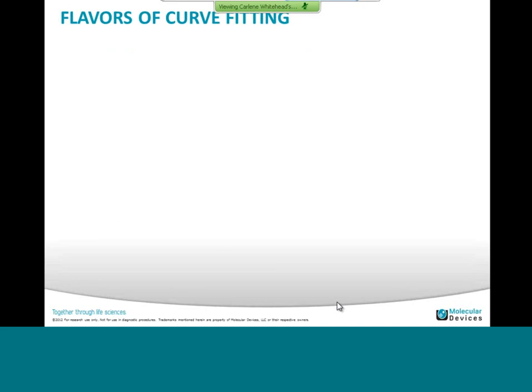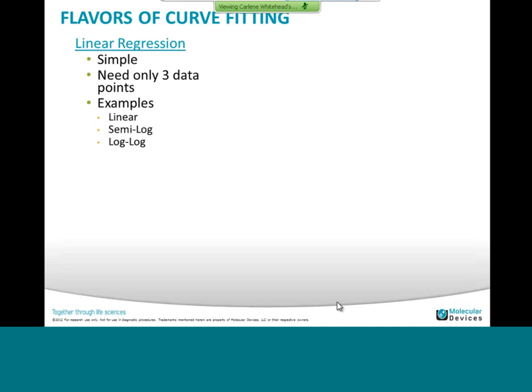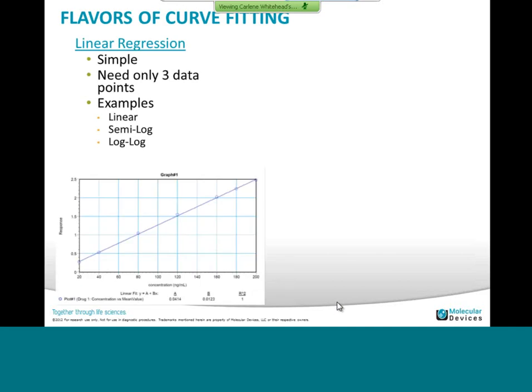So in terms of curve fits, you can have two types. You have the linear regression and the nonlinear regression. Linear regressions are quite simple. You will need only 3 data points in order to use that regression model, and you can choose from linear, semi-log, or log-log. Here you have an example of a linear regression, which is described by the equation y equals a plus bx.